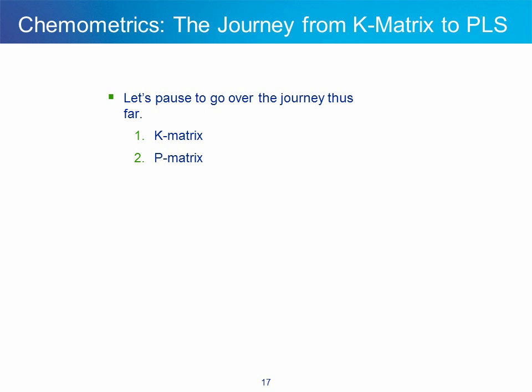We found out, however, that due to the requirement of the matrix operations to produce a calibration, we need at least as many calibration standard spectra as wave number values used. For many applications, this requirement is impractical.